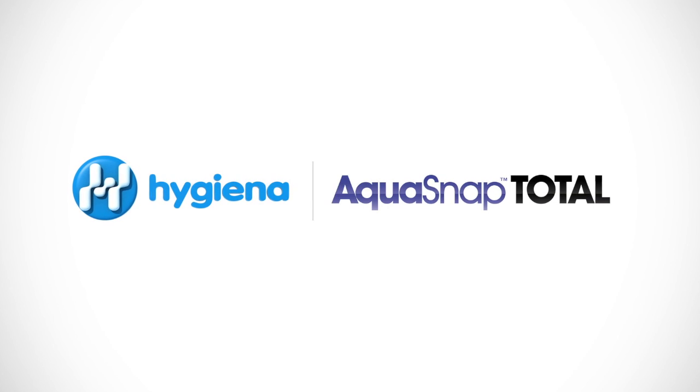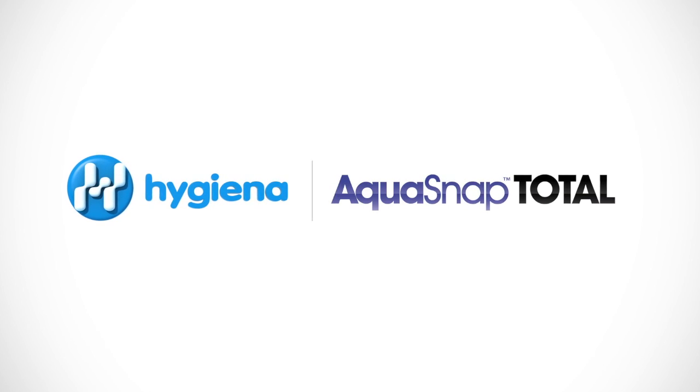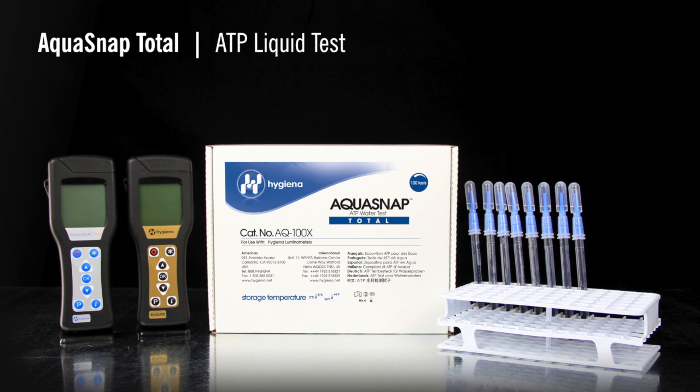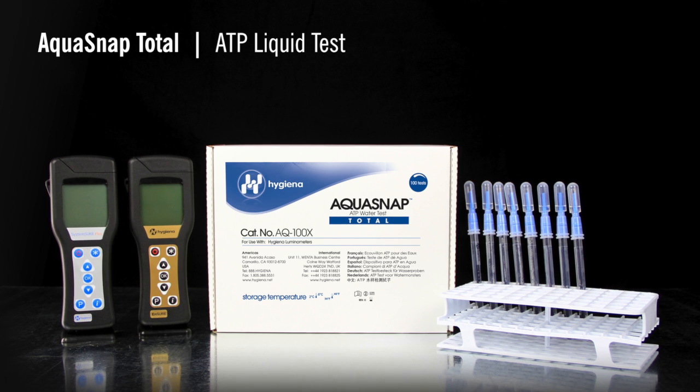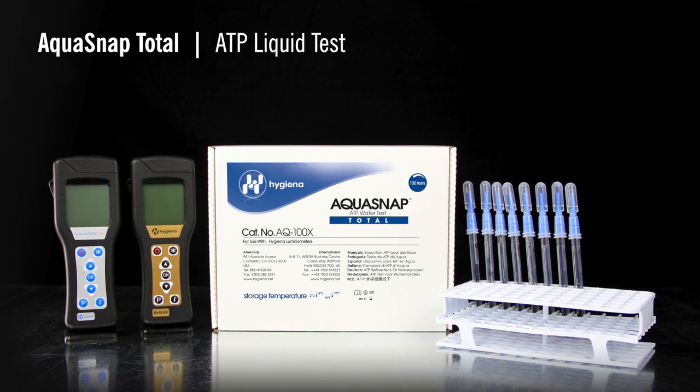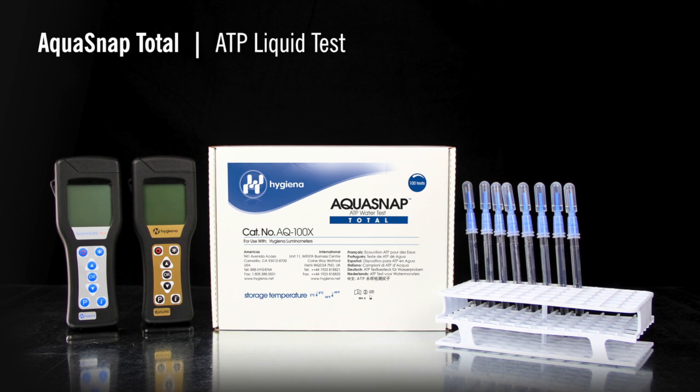This instructional video will demonstrate the proper use of Aquasnap, Hygiena's ATP test for water samples. Aquasnap detects both organic and microbial contamination. It is often used as a tool for the management of water systems, such as cooling towers or clean-in-place systems.